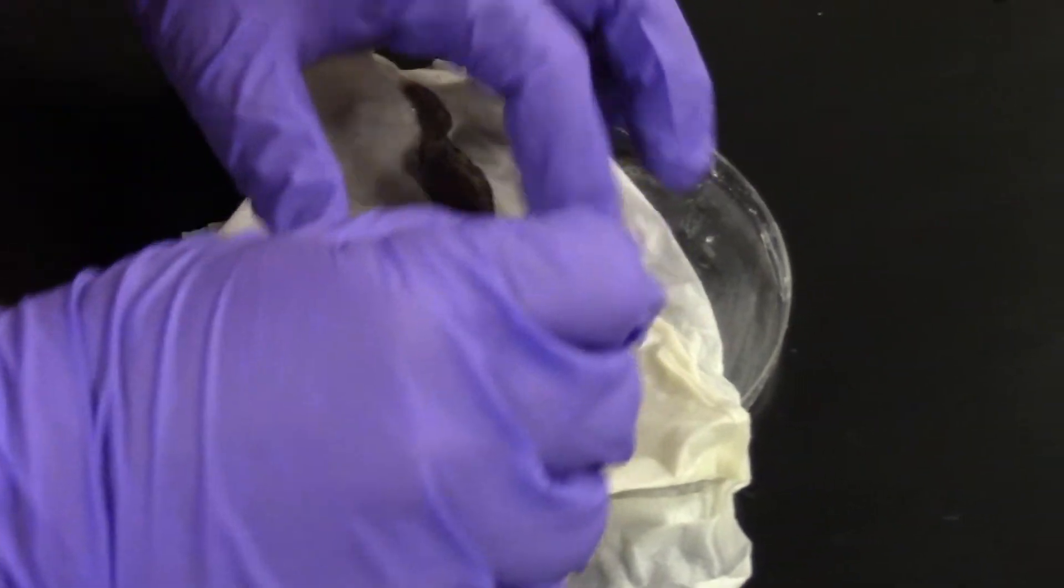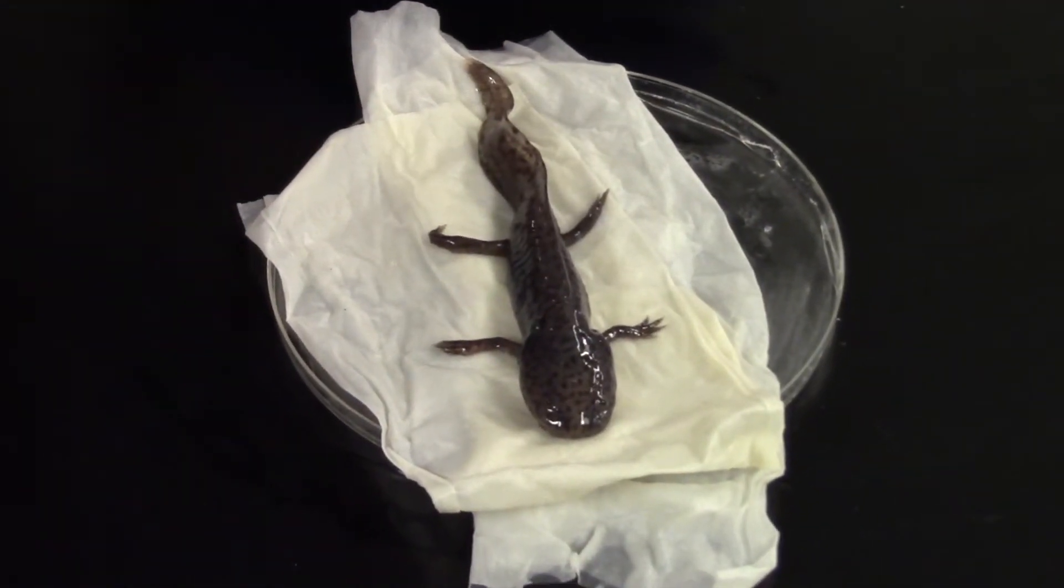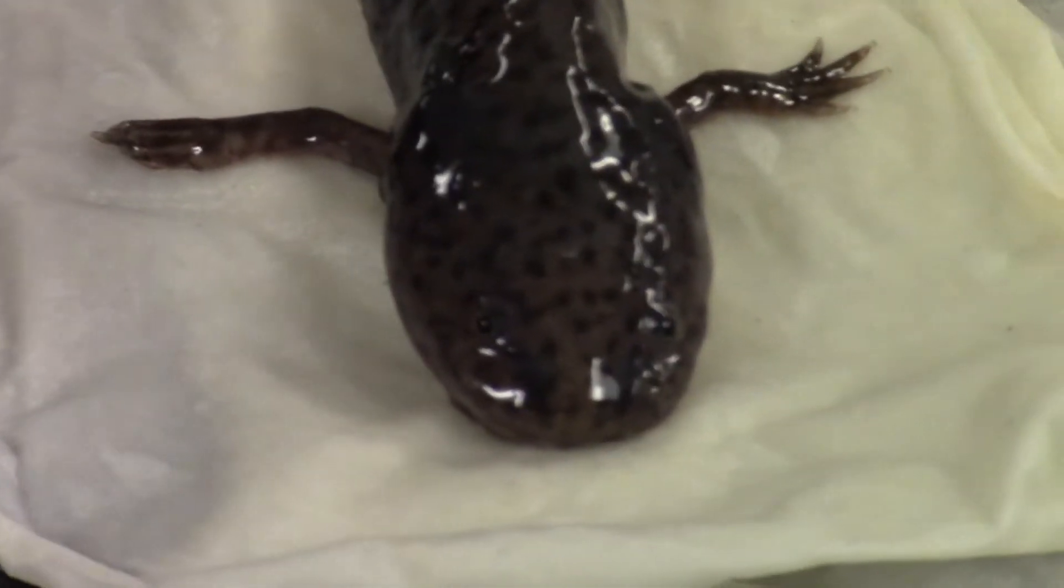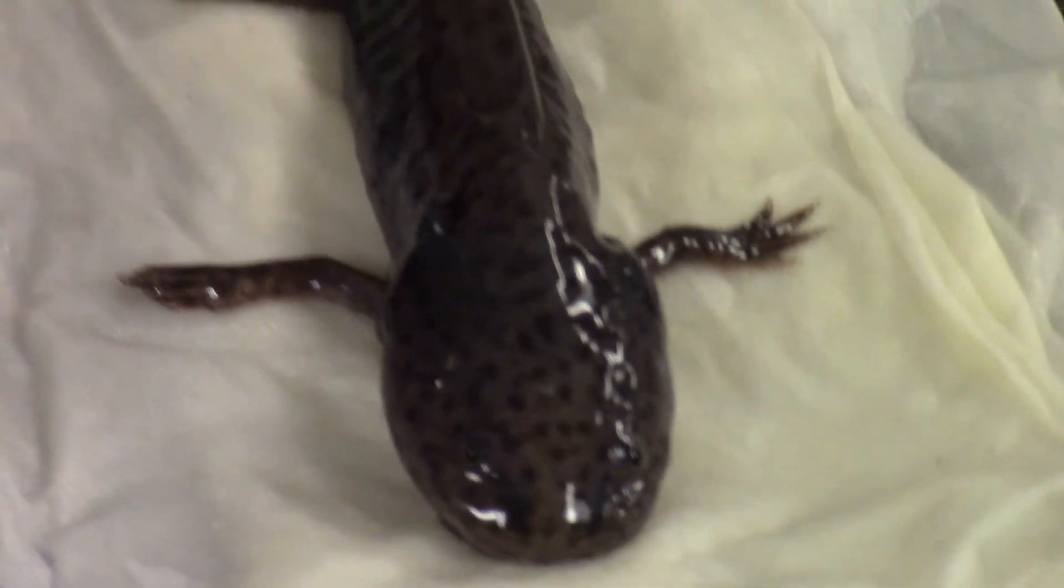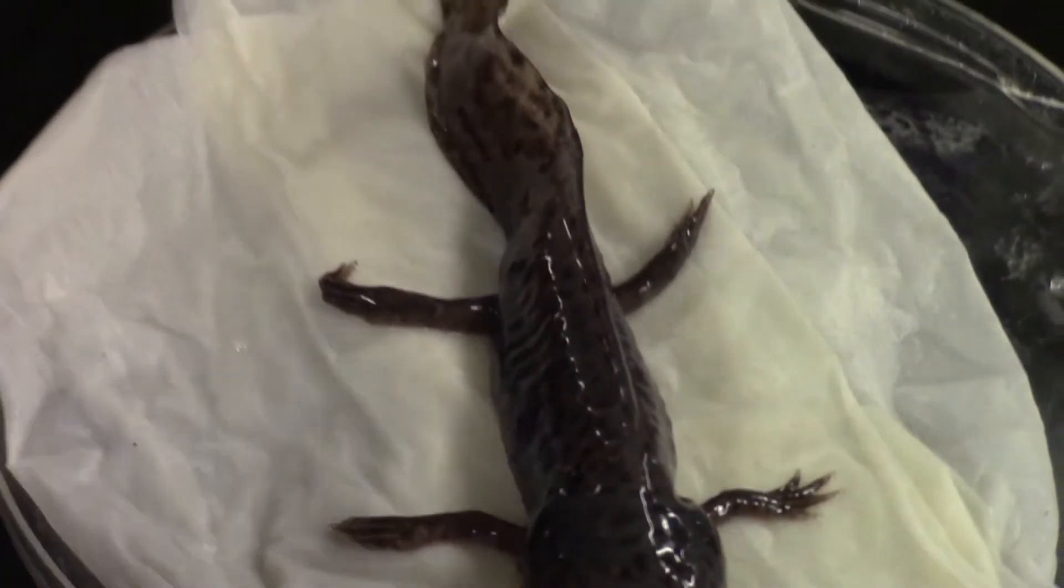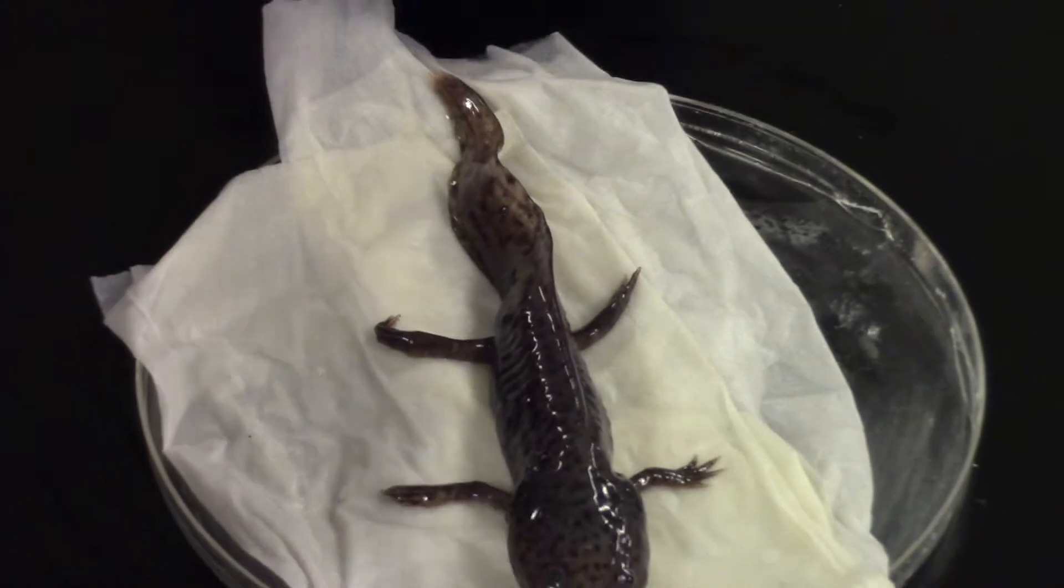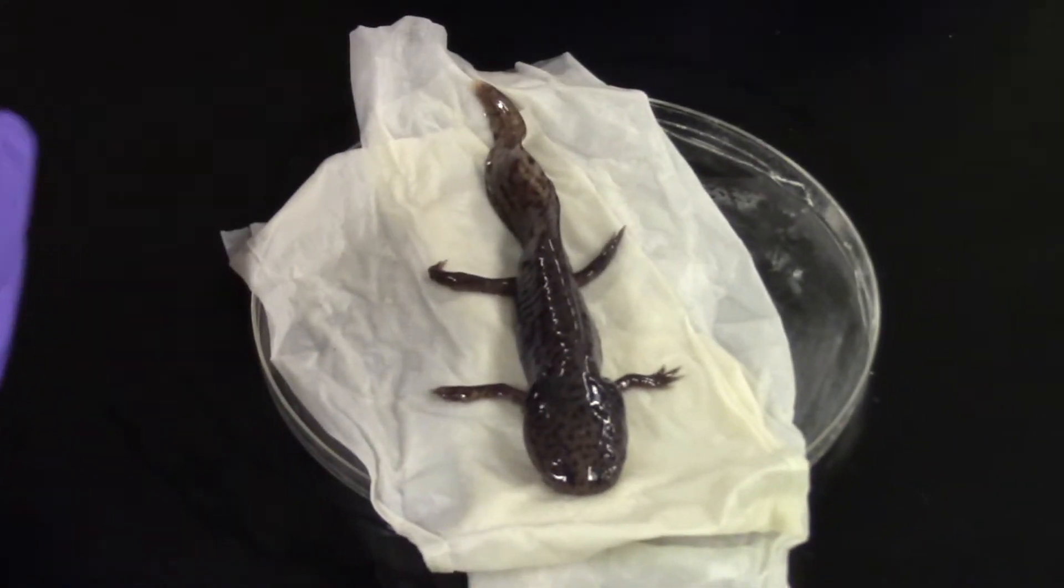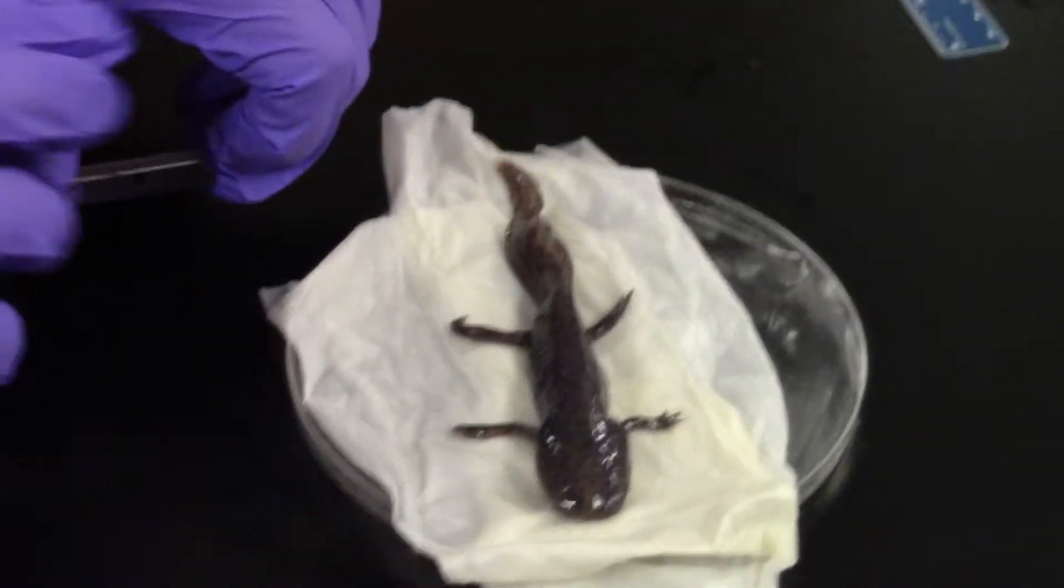So remember please, developmental biology students, we call this amputation under anesthesia. We never say things like chop somebody's limb off because we care about these animals. Okay seriously, they are my pets.